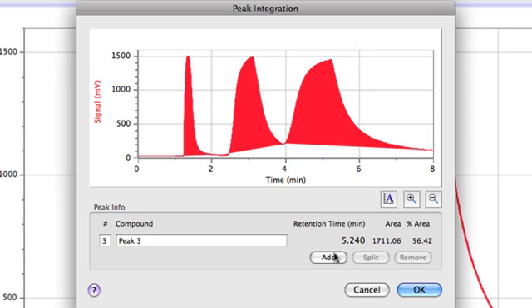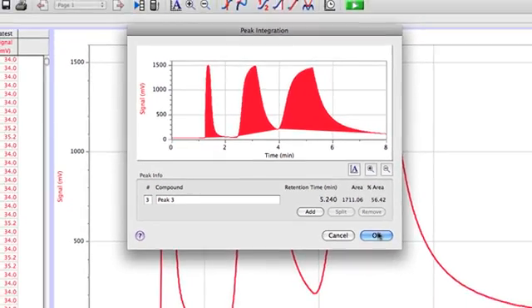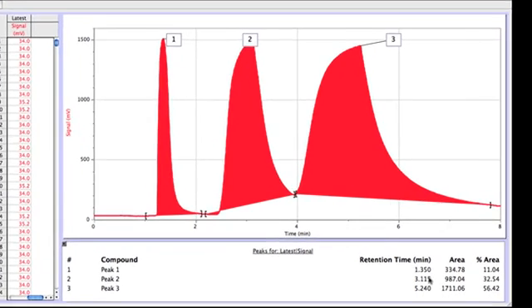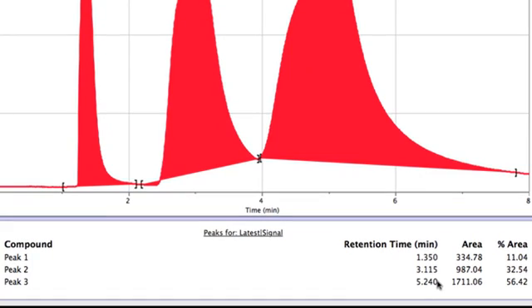And now notice that in my dialog box, I have identified each of the three peaks and the retention times and integrals have been calculated. Now by clicking OK in the dialog box, the information is transferred to the main graph screen in Logger Pro. So now I have each peak labeled on the graph and below it, there's a text box that describes my peaks as one, two, and three. The retention times are given in that text box as well as the peak areas. And finally, the relative percent of the total area of each one of the peaks.